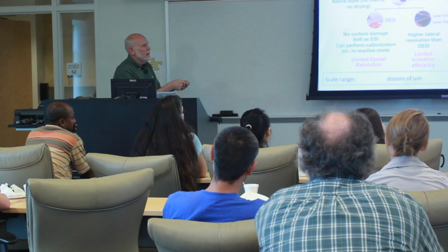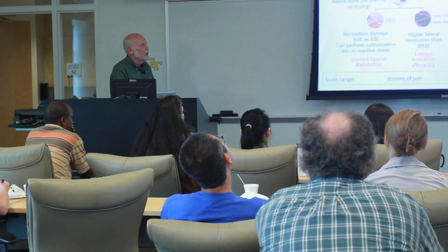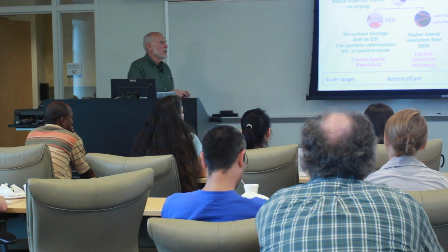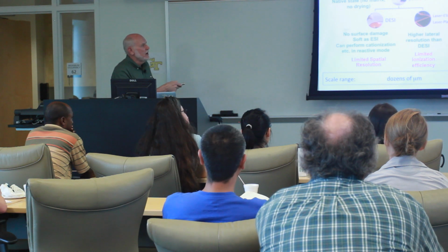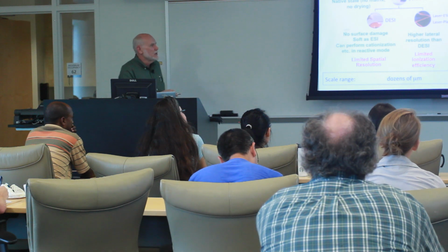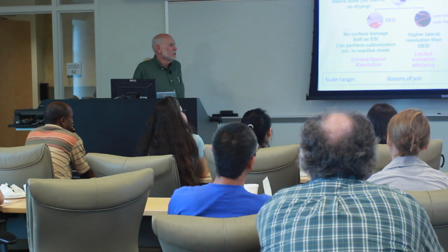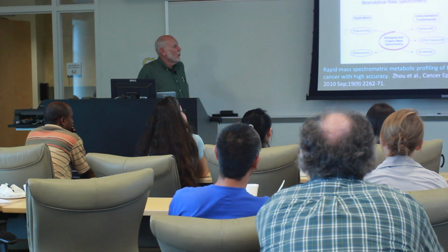You can argue that perhaps if you're not careful, the deposition of the MALDI matrix material could alter the orientation of molecules in the samples. So each of these have their advantages and disadvantages, as Facundo has summarized here. And if you want to know about that in detail, since we're short of time, send me an email and I'll send you the PowerPoint presentation.